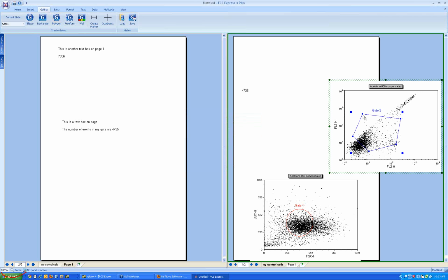You notice that the vertices are all there, and you can actually resize a single vertex, just like you could before. But there are 4 circles. You can see there's one here on the outside, one here at the bottom right, on the bottom left, and on the top left. I don't know if you can see the spotlight that I have on them. Let me circle them for you. So there's one here, and here, and here.